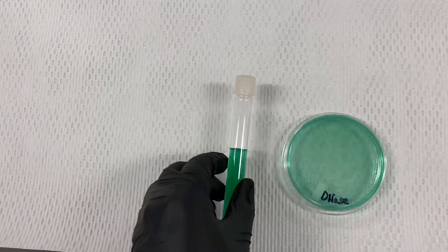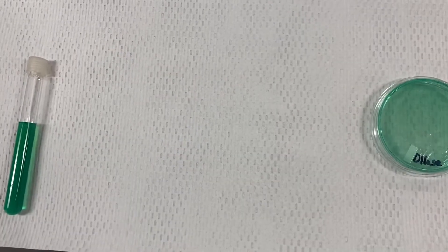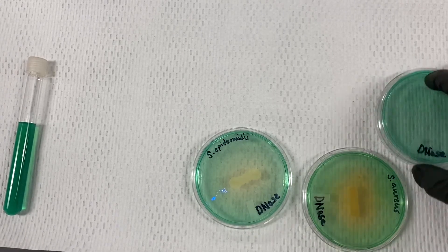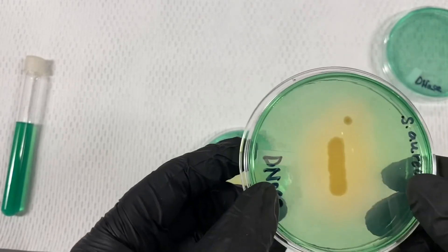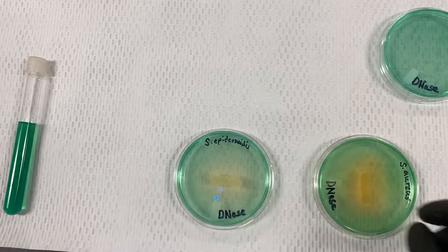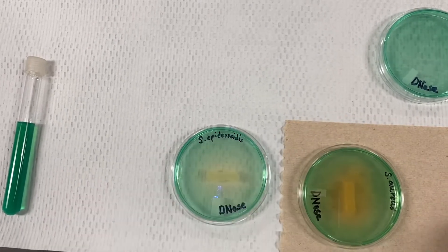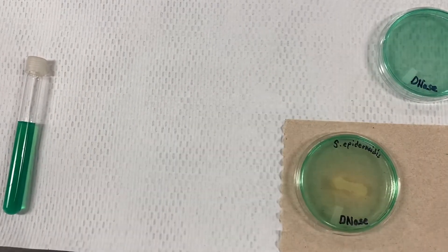For Lab 24, looking for DNase, we have plates prepared using media enriched in DNA. We inoculate these and then observe if the organism has the ability to use DNase. When it does, it will eat up the DNA present in that green media and turn it roughly yellow or transparent. Certain organisms have this ability, and the zone of clearance can look a little clearer on a darker background where you can see the discoloration.